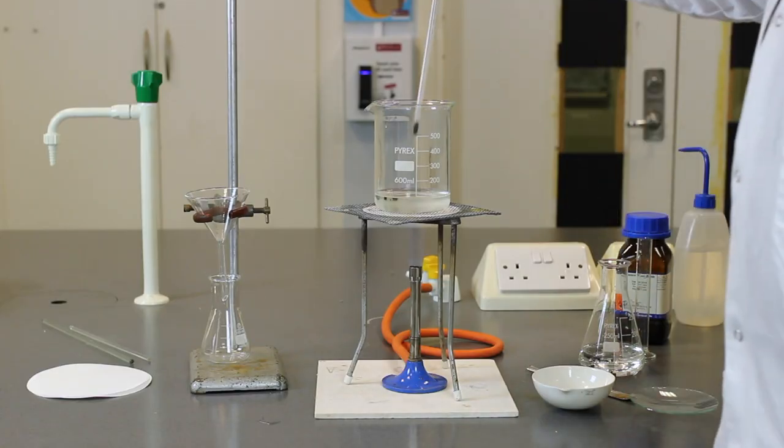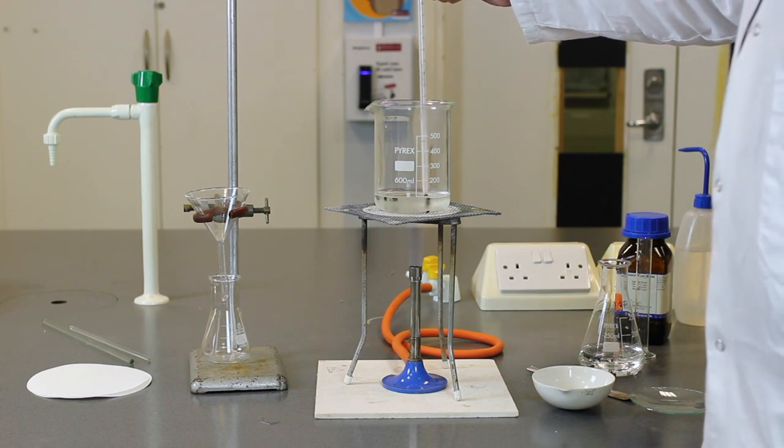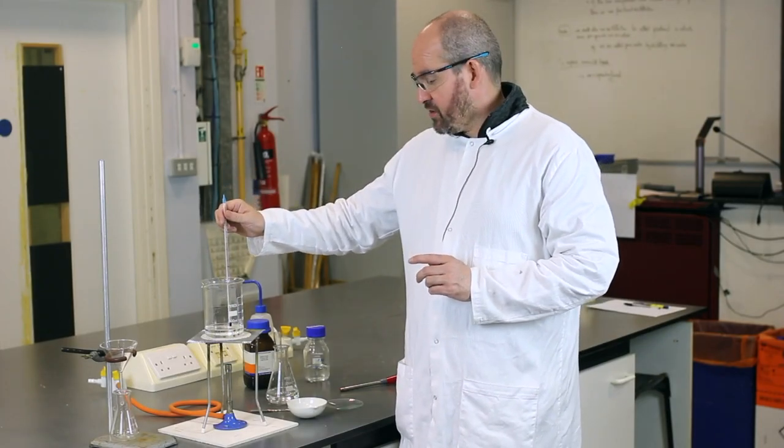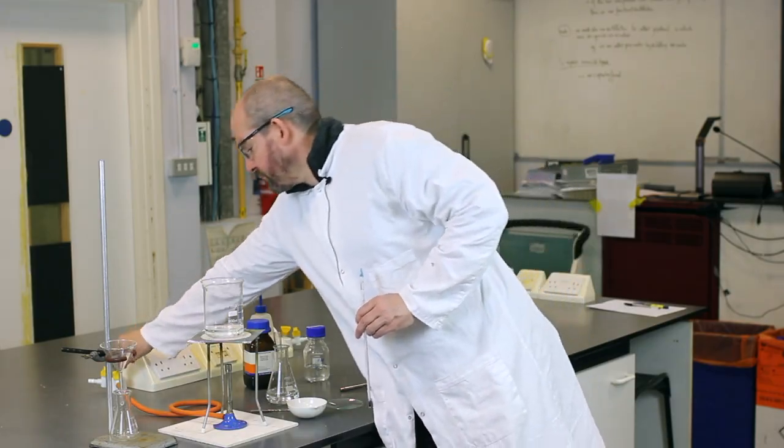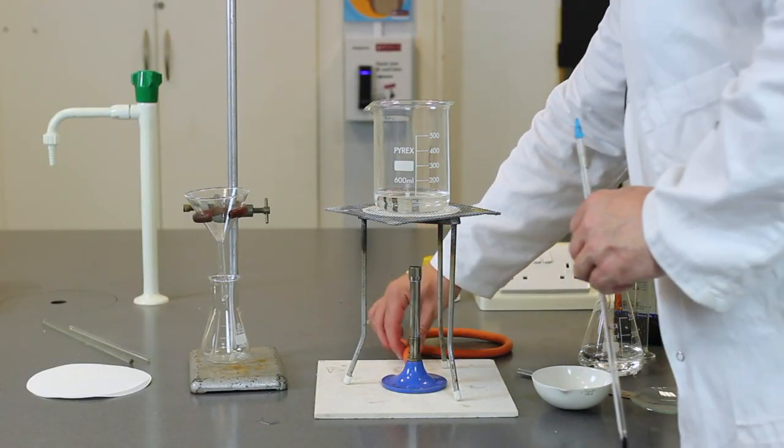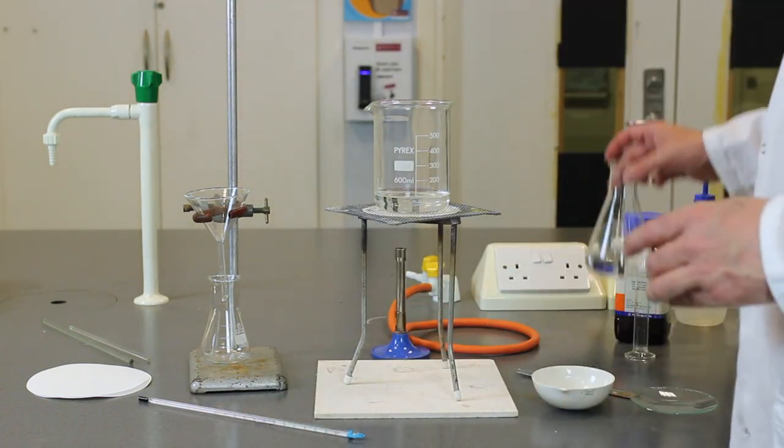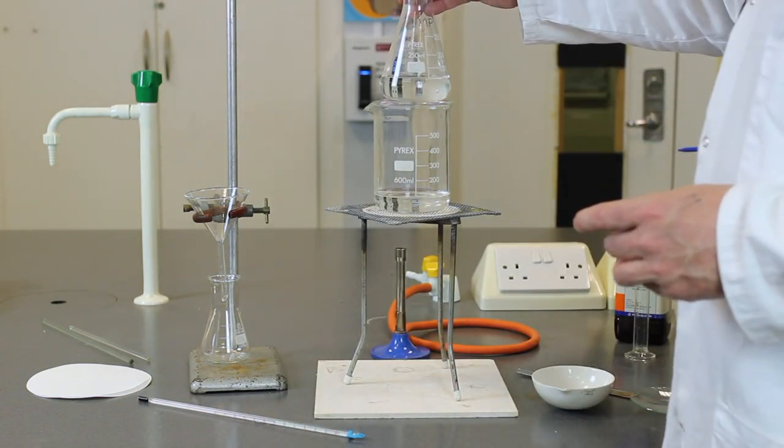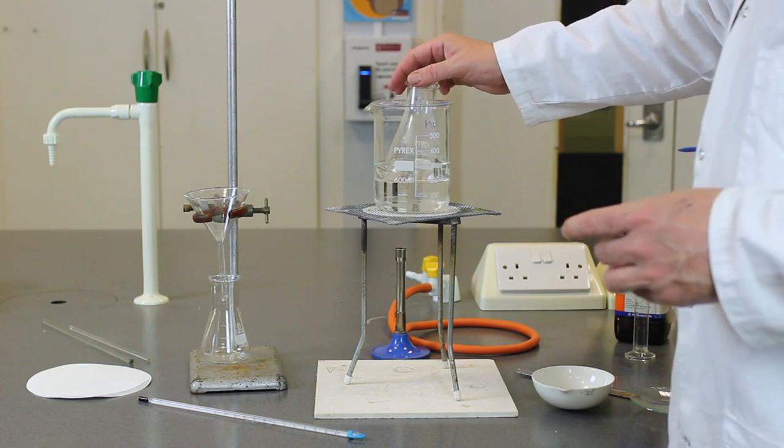So you can use a thermometer like this one here to measure the temperature as it heats. So I'll just put that in. The temperature now above 50 degrees Celsius. So the next stage is to turn the Bunsen off, and we're now going to place the sulphuric acid solution into the water bath. And we're going to leave that a few minutes so that the acid is at the right temperature.